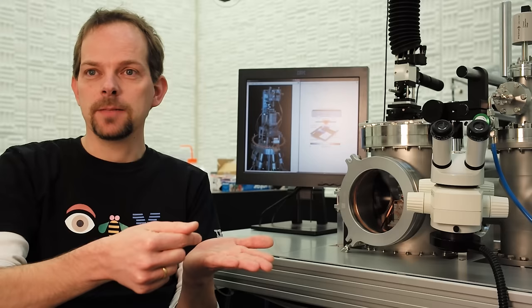But you can also scan across surfaces and get a picture of whatever you sense alongside the structure.